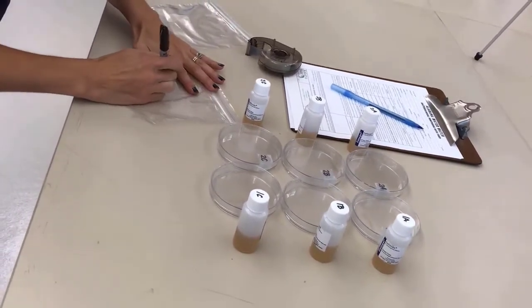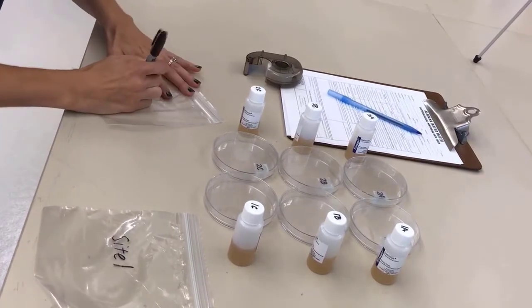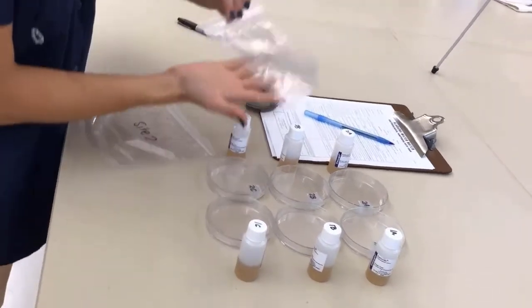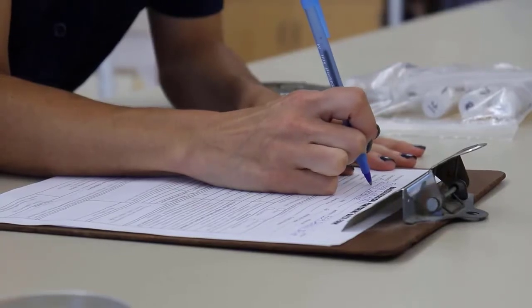It's also a good idea to label the Ziploc bags containing the media bottles with the site number before loading up to leave. Good organization goes a long way in preventing mistakes. Filling out the data form.